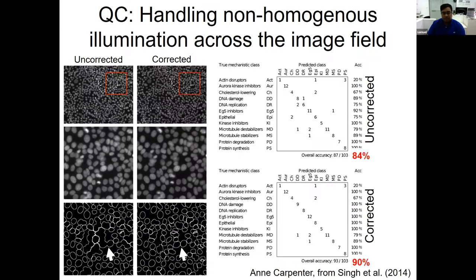Asaf, can I ask a question? Yeah. So for image-based phenotyping for drug discovery, on the hits, which you said, how will you get three-dimensional coordinates for the hits from an image? Hits are the treatments.